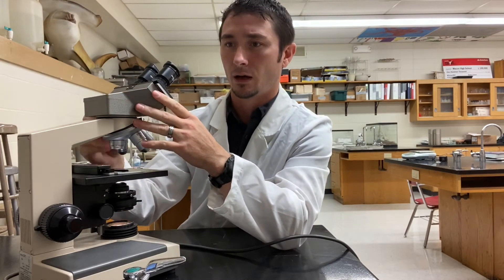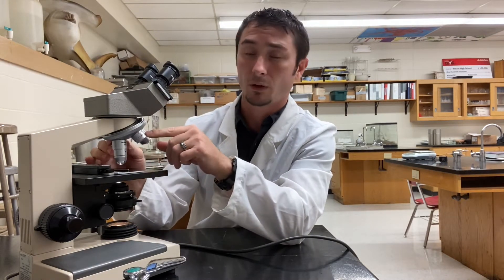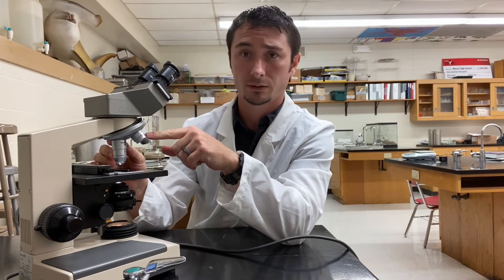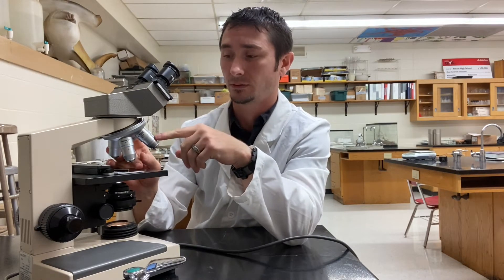The next thing you have is the rotating nosepiece. These hold your objective lenses and allow you to move from side to side so you can figure out what magnification is best for looking at the specimen. You have the smallest one, which is red — that is 4x, meaning four times normal vision. You have the 10x, which is ten times normal vision. You have the 40x, which is forty times normal vision. And then you have the last one, the 100x.